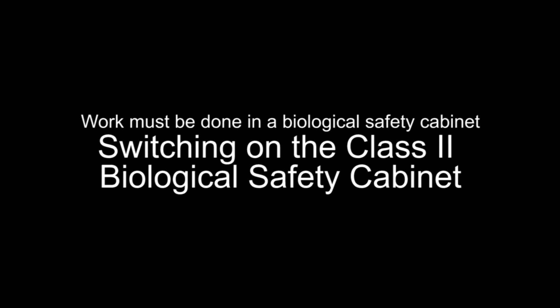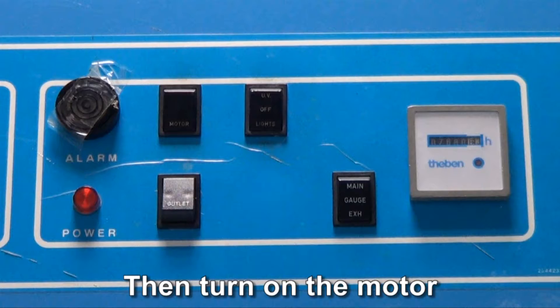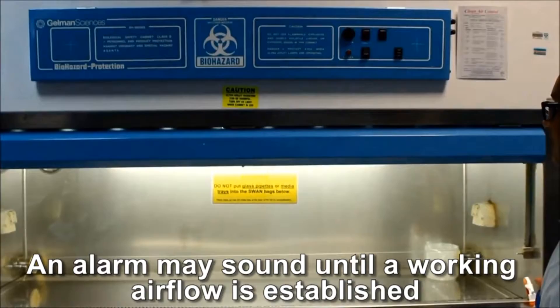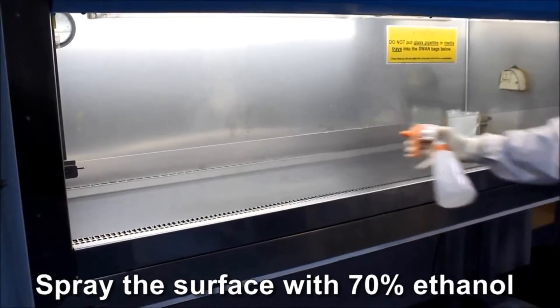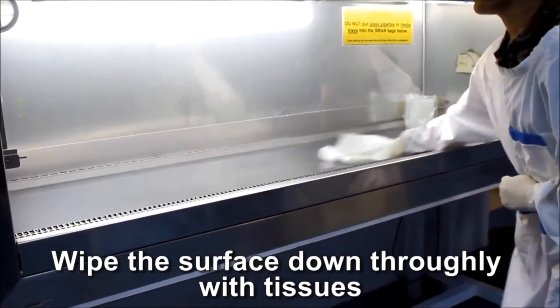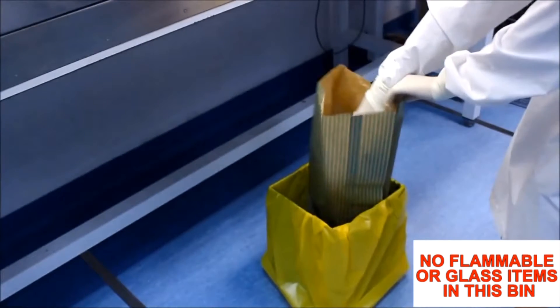Switch on the Class 2 biological safety cabinet: switch the UV light off, switch the white light on, then turn on the motor. Wait for the working air flow to be established. Spray the surface with 70% ethanol and wipe the surface down with tissues. Discard the tissues into a biological waste bin.